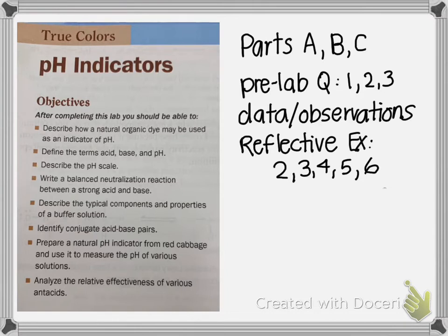Now, I would recommend before you start the lab to get your lab packet so you can have your procedure and data right there as you're going through this lab video with me. The other thing I would recommend is that before you even start any of it, you go ahead and read the introduction so you have some background information for some of the words I'm using and for what we're talking about. If you'd like more background information, this lab corresponds to the chapter of acids and bases in your textbook.